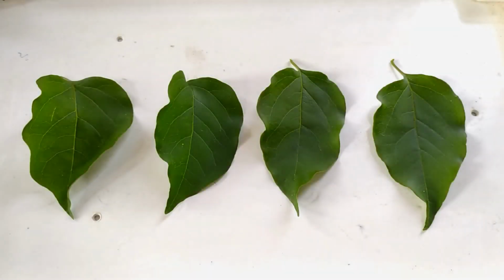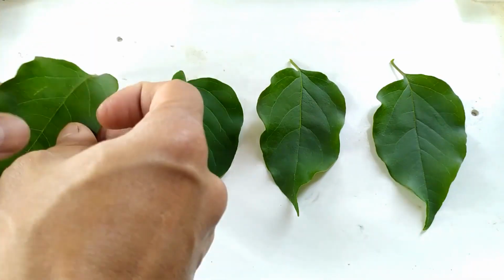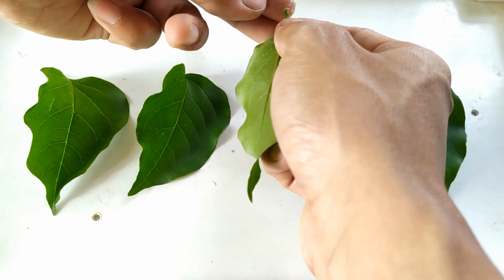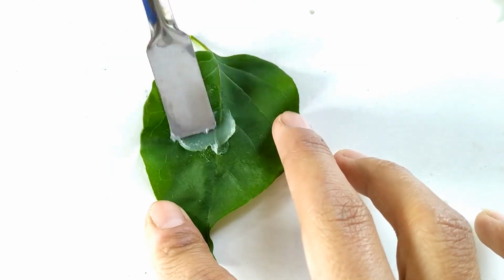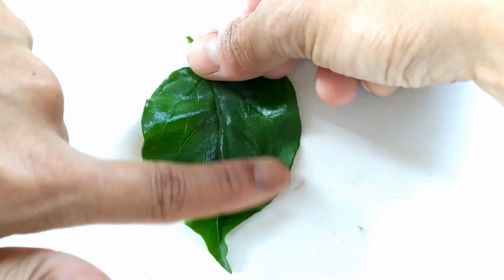To begin the experiment, take the four freshly plucked leaves. Apply grease on the plucked ends of each of their petioles. In the first leaf, smear grease all over the leaf, both on the upper and lower surfaces.